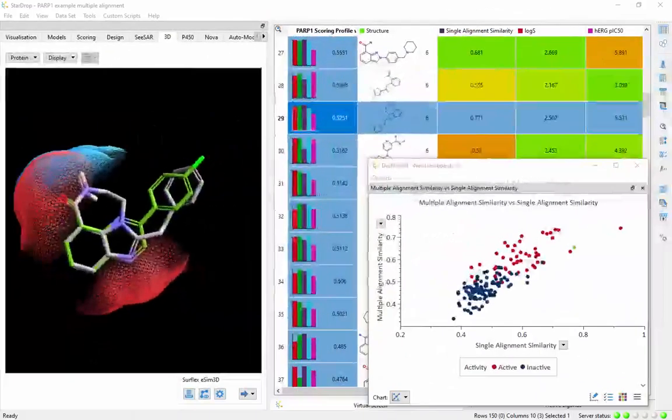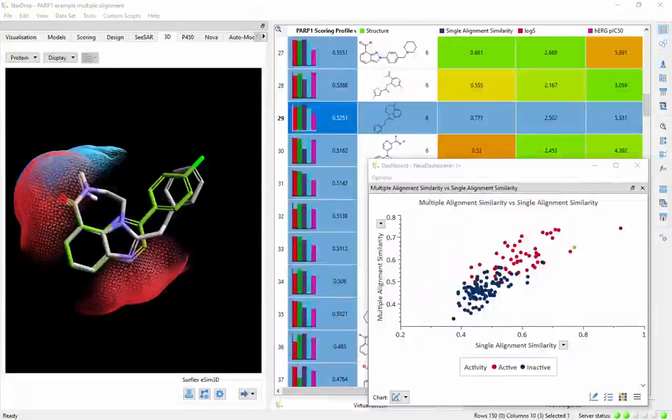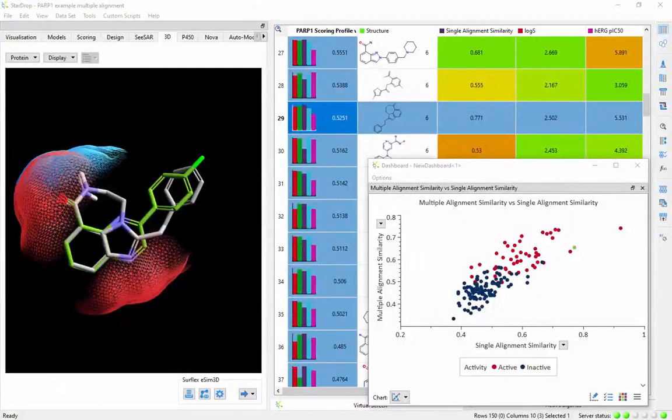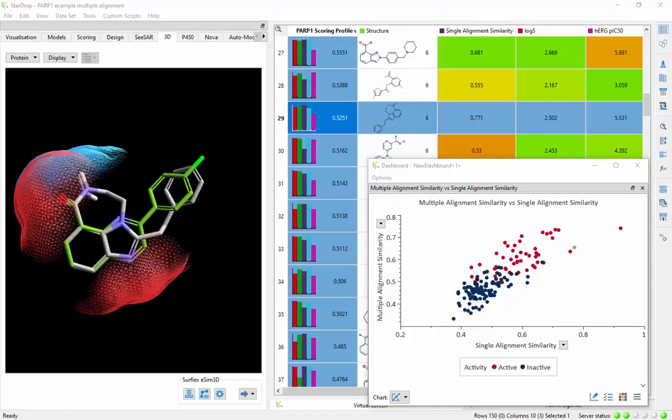Fully integrated with StarDrop's comprehensive capabilities for small molecule design, optimization, and data analysis, Surflex eSIM 3D enables 3D ligand-based design in a multi-parameter optimization environment.